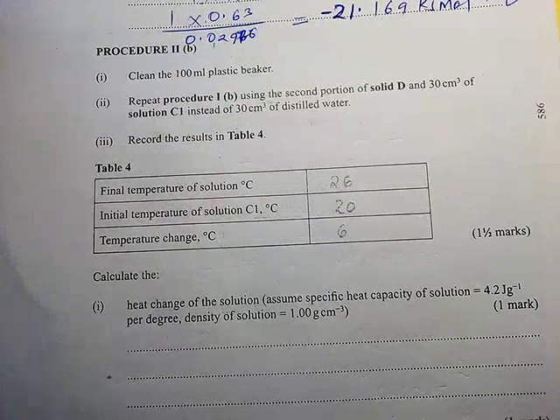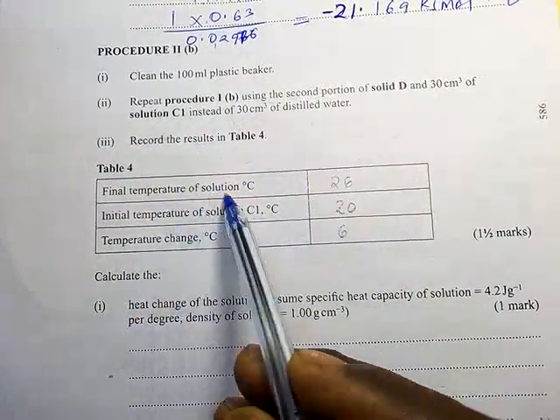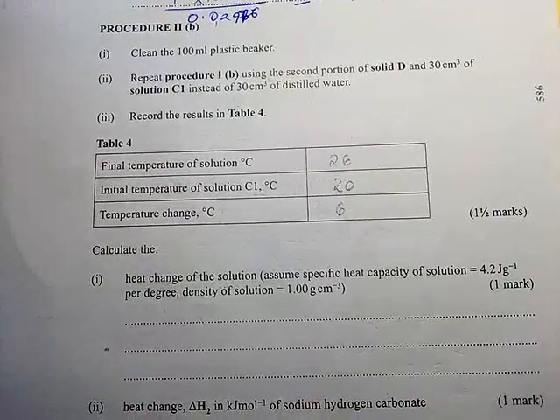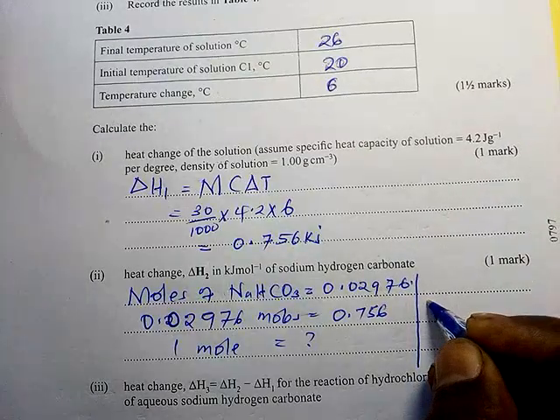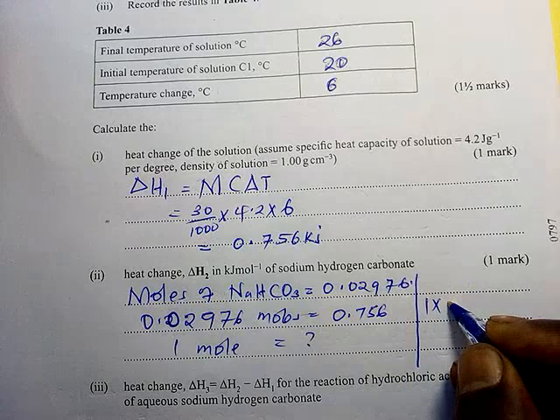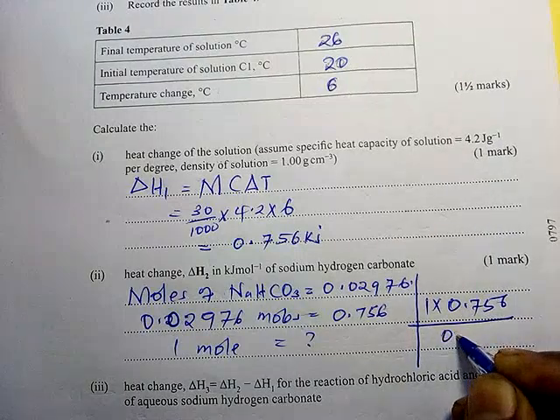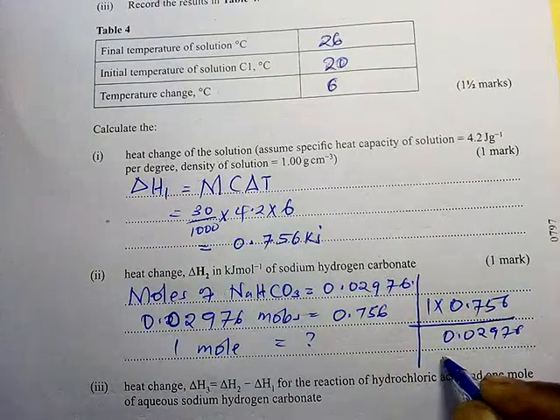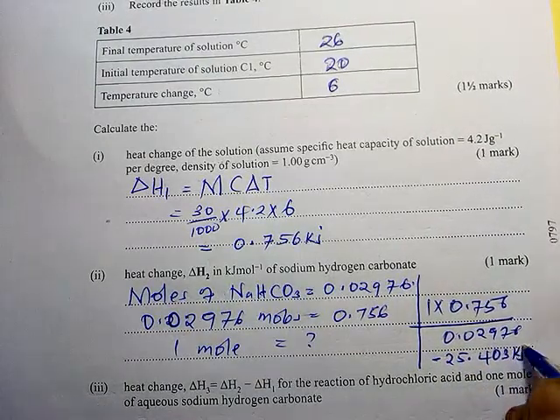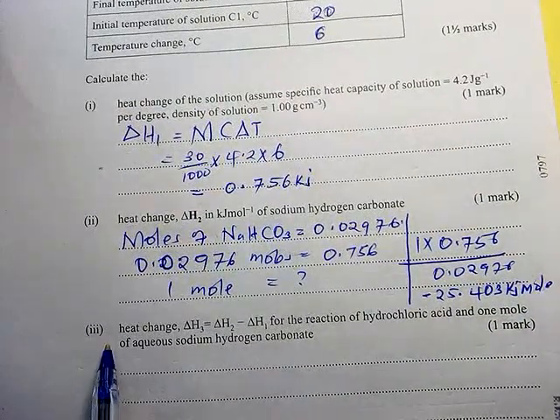Procedure 2B was similar, but the difference is that we were using 30 centimeters cubed of solution C1, HCl, instead of distilled water. So it is the same. That's why I've skipped some steps, because we know how to do that. Divided by 0.02976, and the reaction is negative 25.403 kilojoules per mole.